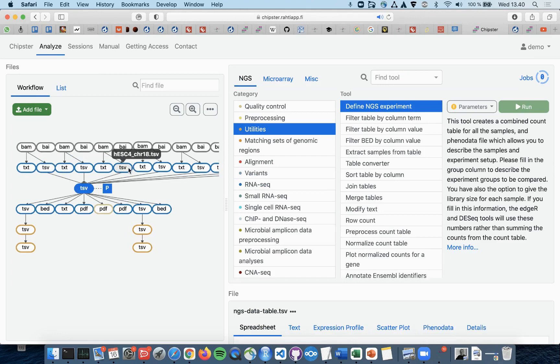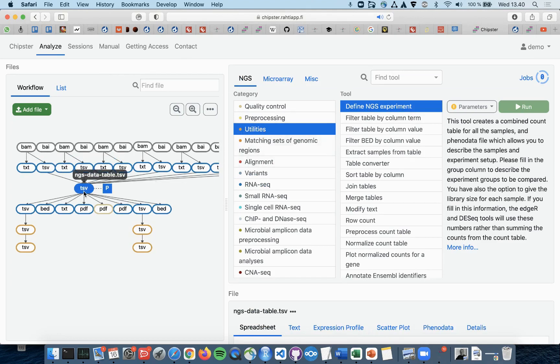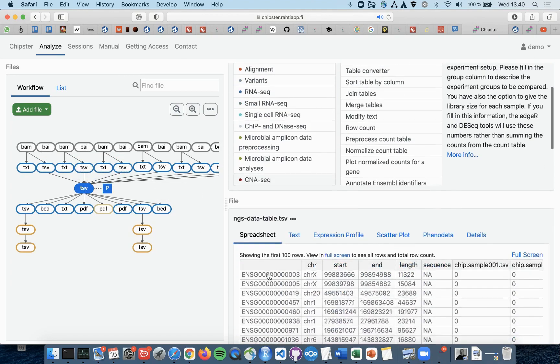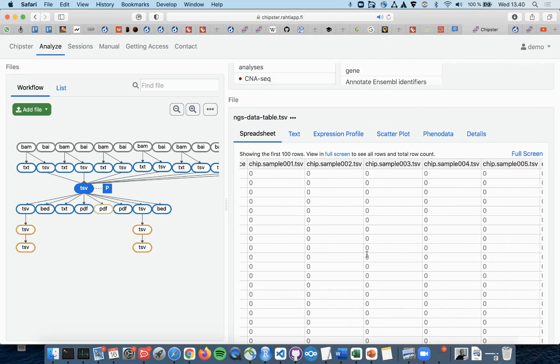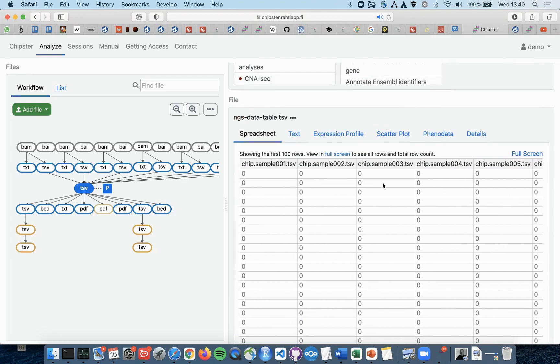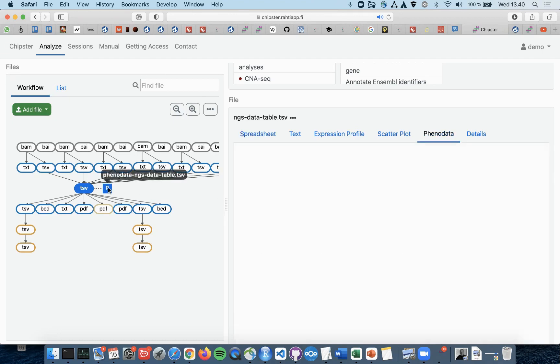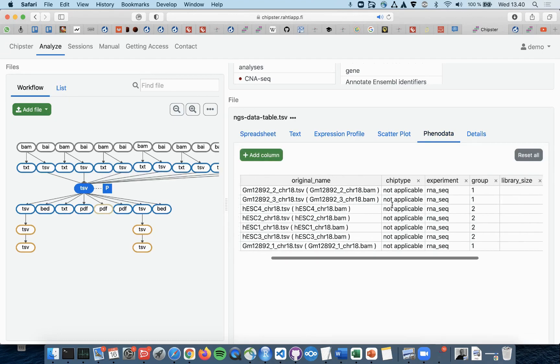These files can be combined with the Define NGS Experiment tool in the Utilities category. This tool combines the TSV files into one big TSV file with one column per sample and at the same time creates a phenodata file.